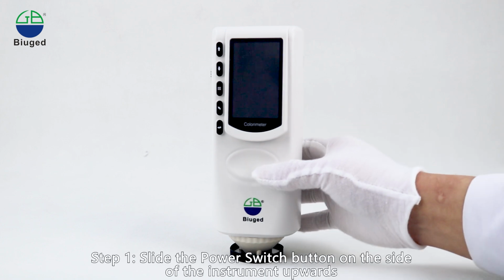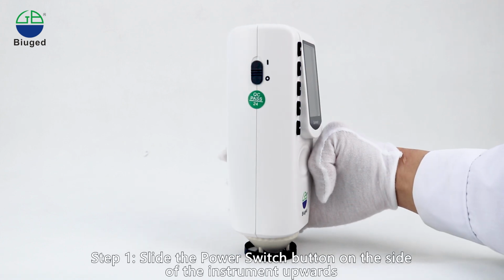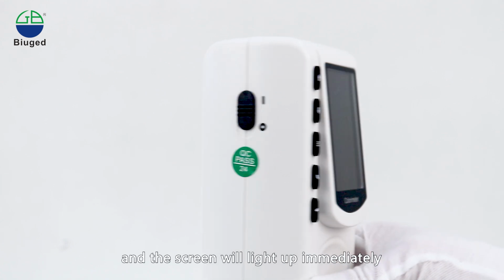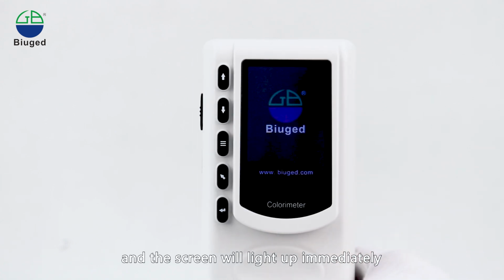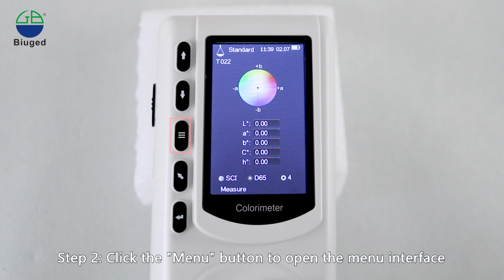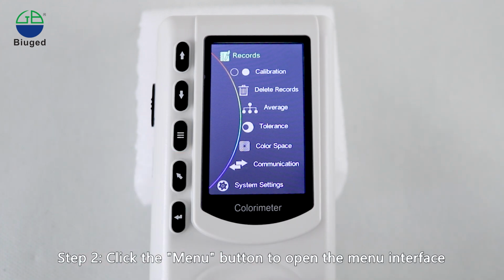Step 1. Slide the power switch button in the side of the instrument upwards, and the screen will light up immediately. Step 2. Click the menu button to open the menu interface.